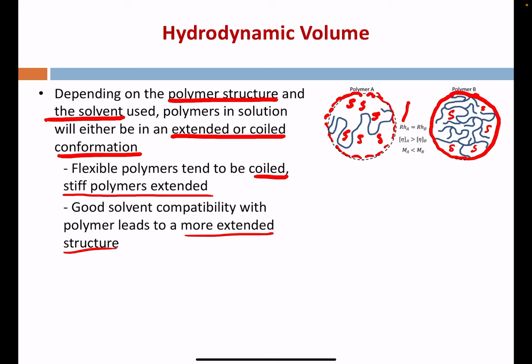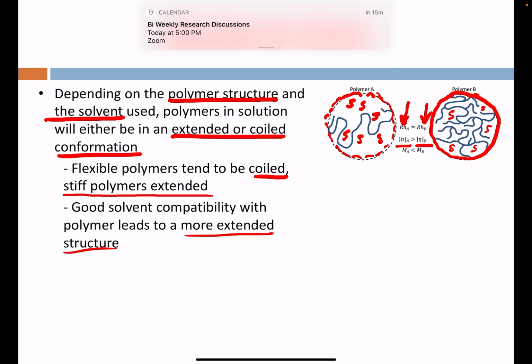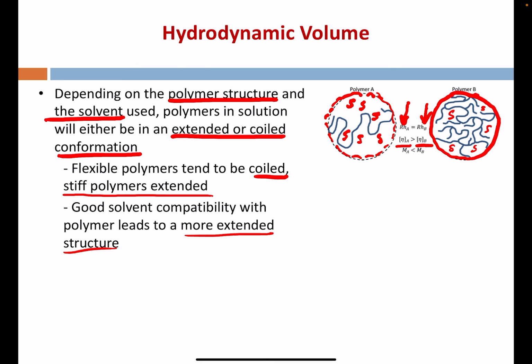So here, the radius for hydrodynamic size for sample A would match the hydrodynamic radius of sample B, and properties like viscosity, the viscosity of A would be larger than the viscosity of B, given the opportunity for more extended chains and entanglement as chains like those at left bump and interact with one another. And the overall mass of sample A, as we noted, would be less given the more regular structure with little branch content versus the mass at right for sample B.